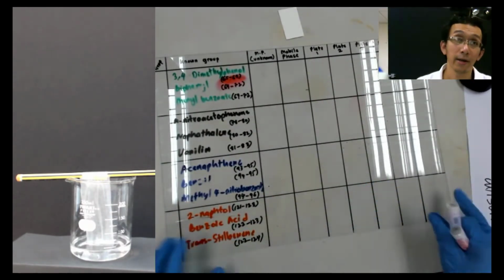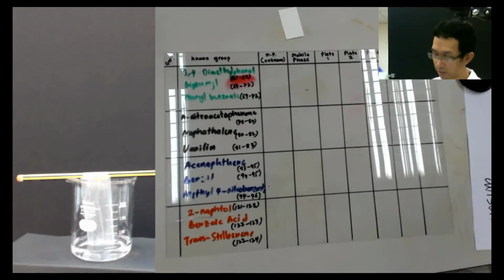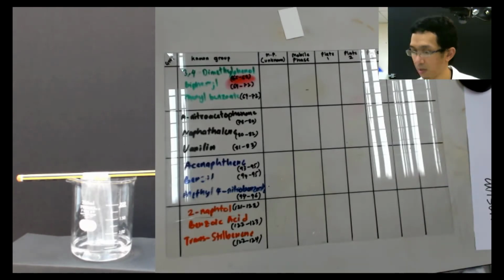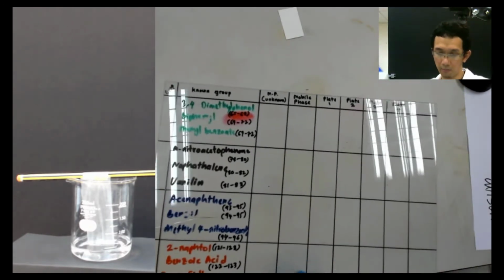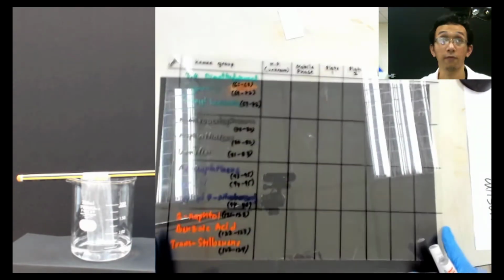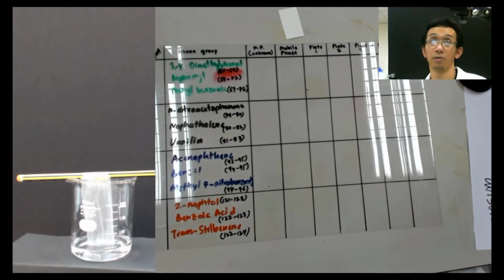X and Y. You can see now, but there is quite a lot of reflection. Maybe I can use black underneath, but I don't know whether it will reflect also. Same thing, it's reflection from the light, so cannot do anything.